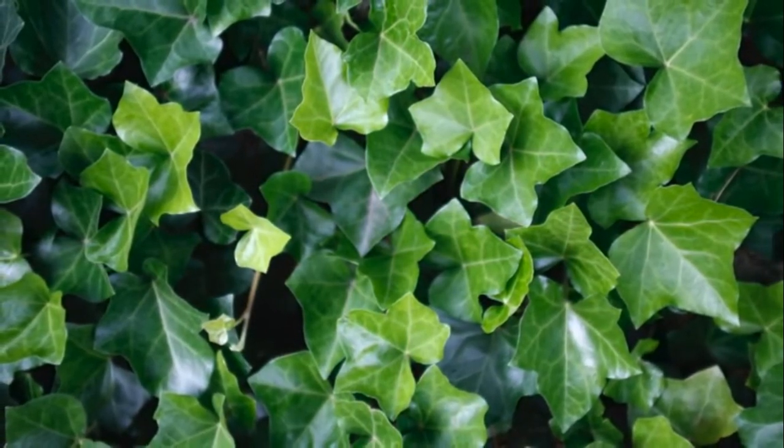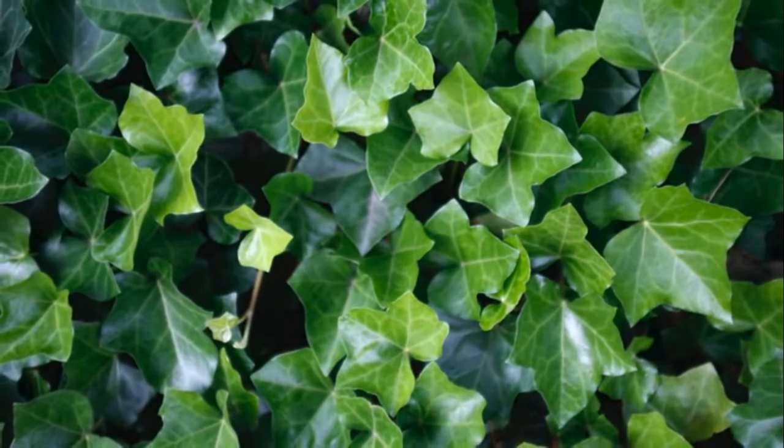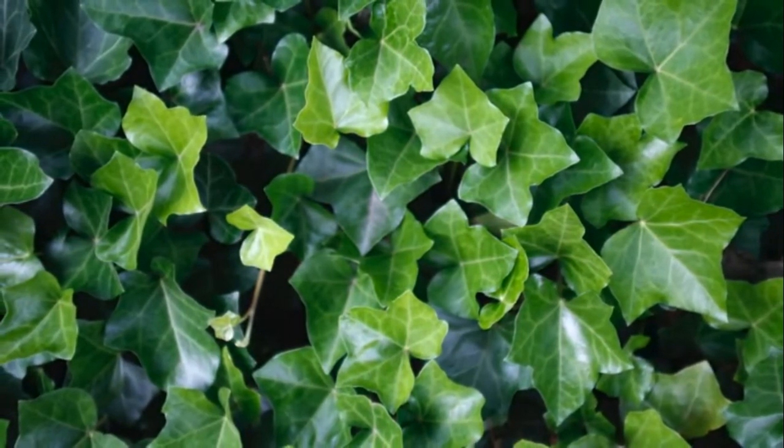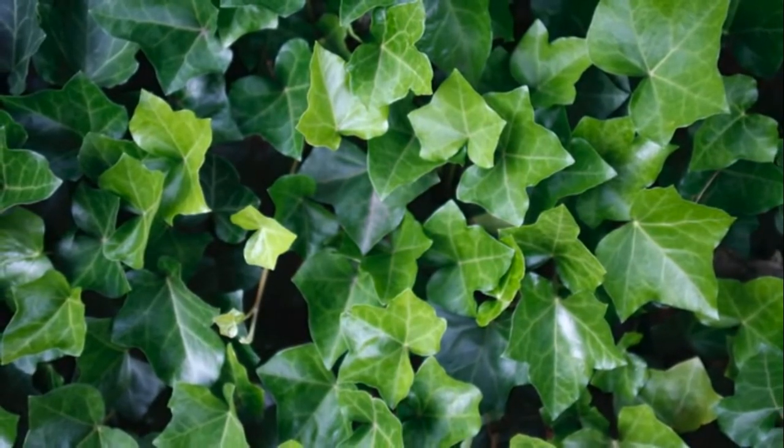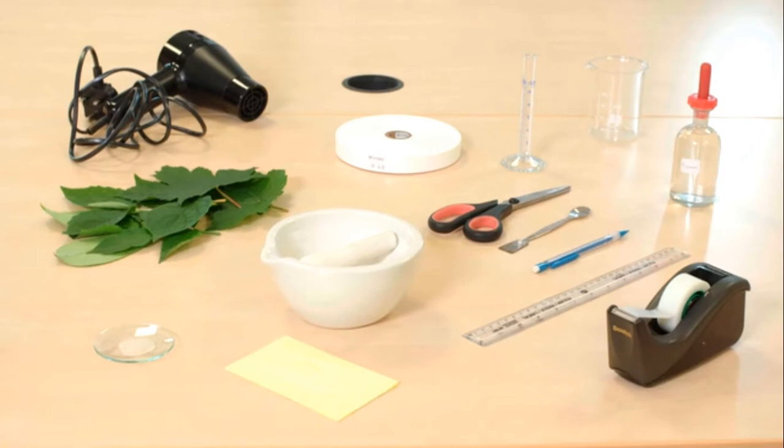In chemistry, finding out the content of mixtures is important, and chromatography is a technique that can be used to find the individual components in a mixture. In this experiment, the pigments in a leaf will be separated by paper chromatography.